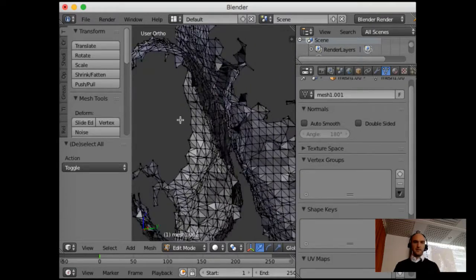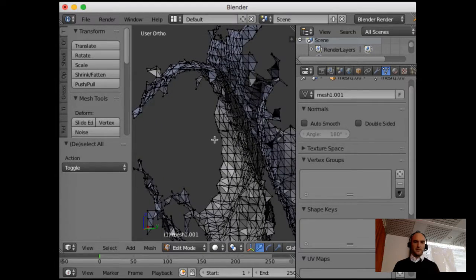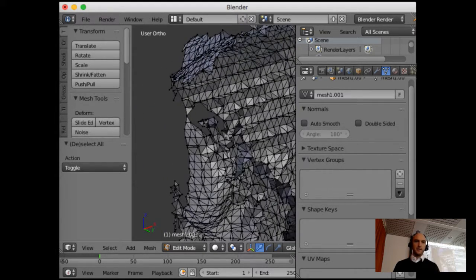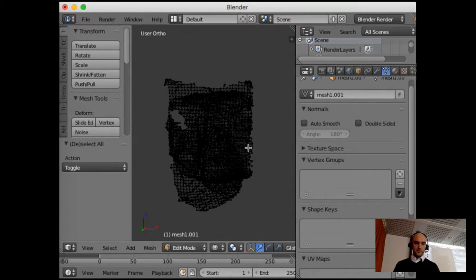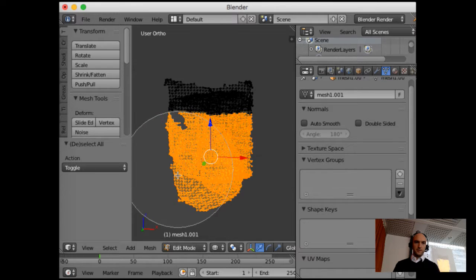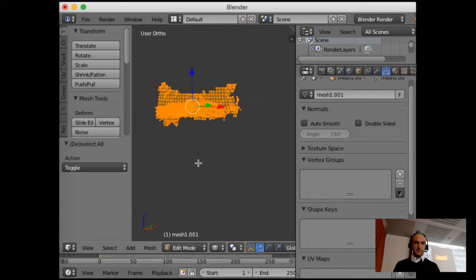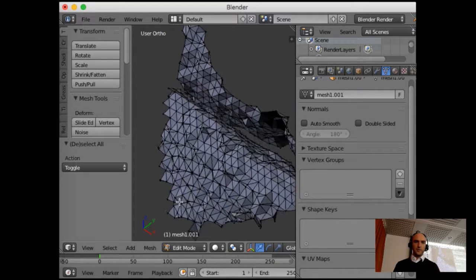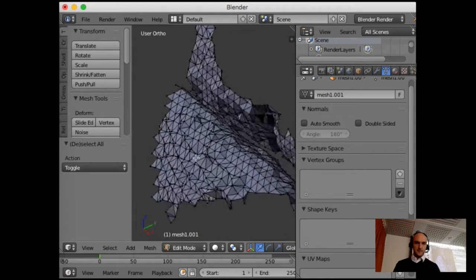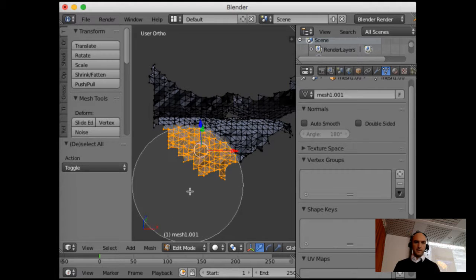What I like to do in this case is actually just get rid of everything I don't need. So you can just zoom out, press Z, so it will become transparent, and just mark that bit and press H to hide it. And now you see it's all hidden, and we can work with the remaining parts up here. We can zoom out and just mark this bit here.